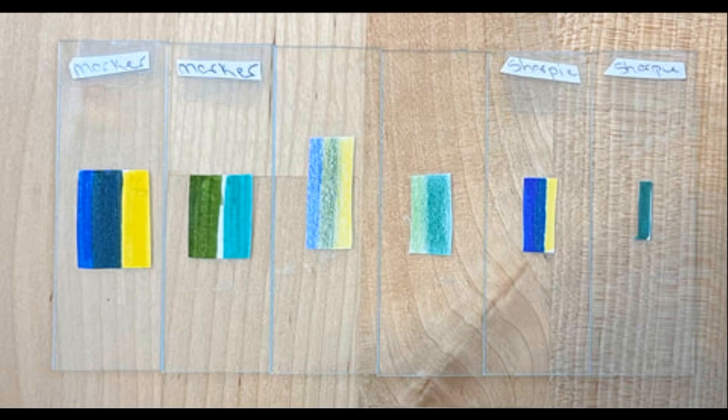To demonstrate this phenomenon, let's compare manufactured green pigment with handmade green pigment created from a combination of yellow and blue and study them under a Foldscope.